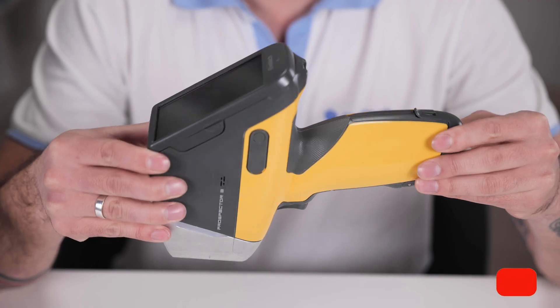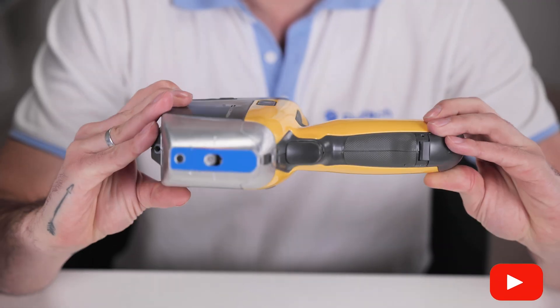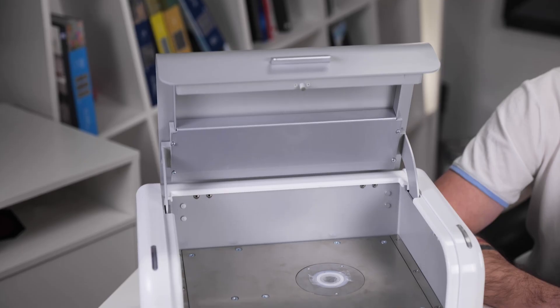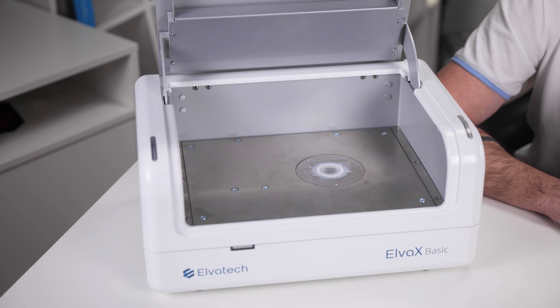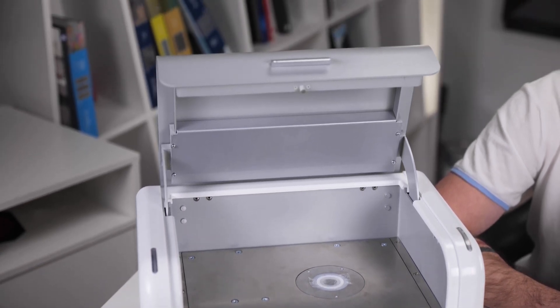XRF analyzers are used in a wide variety of applications due to their ability to quickly and accurately determine the elemental composition of a material. Handheld models are especially appreciated for their mobility and ease of use in the field — they are compact yet powerful and reliable. Benchtop analyzers are designed for more detailed analysis and are ideal for complex analysis in a controlled laboratory environment.